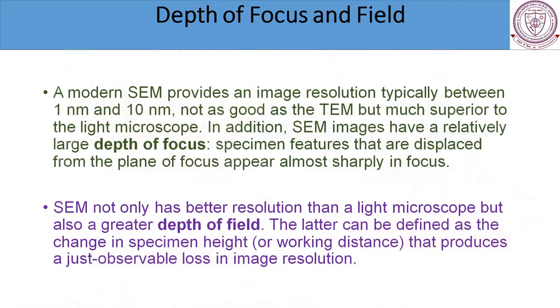So my dear friend, you should be able to understand your sample and what feature you are looking for. Transmission electron microscope, scanning electron microscope is not about taking photographs. It is about getting information out of those micrographs. That's the most important thing, and you should remember it forever. Even for the light microscope, you should be able to appreciate this particular thing.